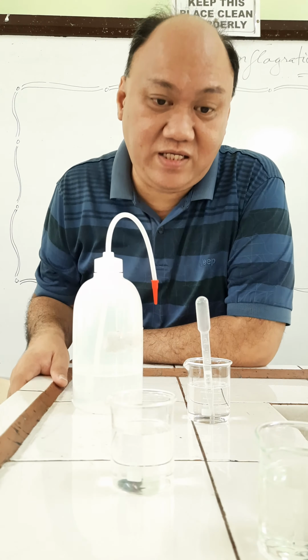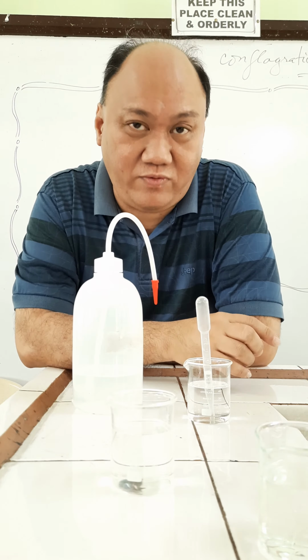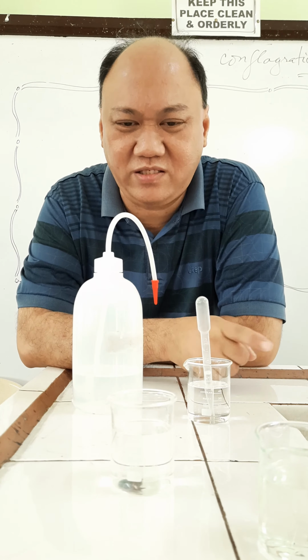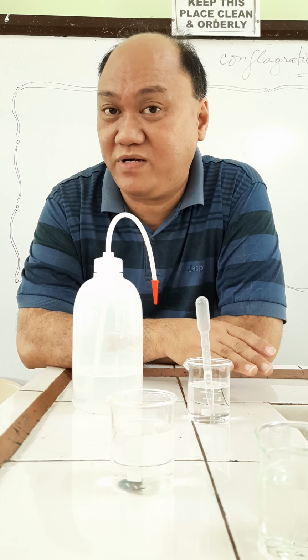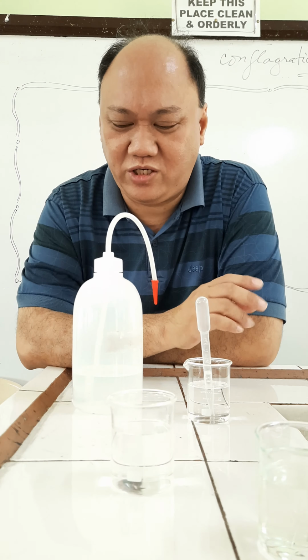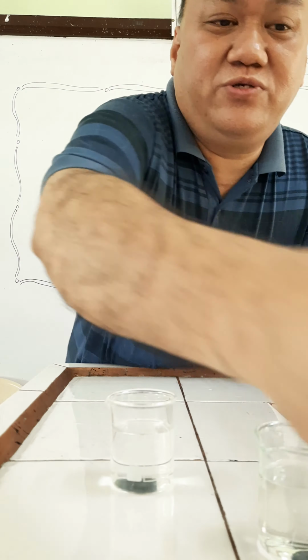Almost the same reading since we are using standardized glasswares. So more or less, they have the same reading. 50 ml from the graduated cylinder, and for the 3 beakers, more or less we cannot really see an appreciable discrepancy. So it's almost the same. Okay, try to make your observation and record the data. Now let's proceed to procedure number 2.